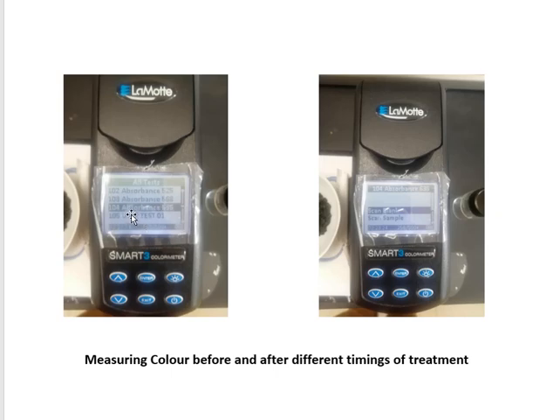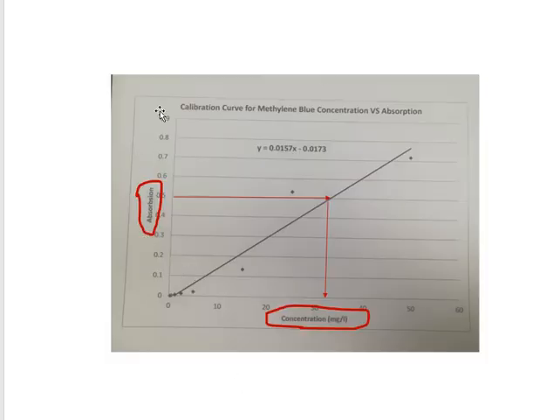Here you have the absorbance. You will measure the absorbance in the same way. First scan the blank using distilled water, then scan the sample. You will get the value of the absorbance. The value you get from here is not the color; the meter will give you the absorbance. So how will you measure the color? By using this graph. This is a calibration curve for measurement of the color.